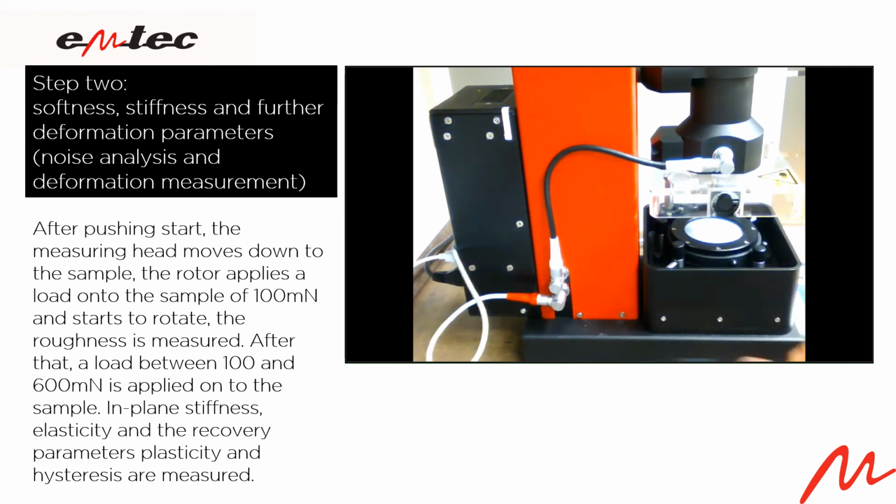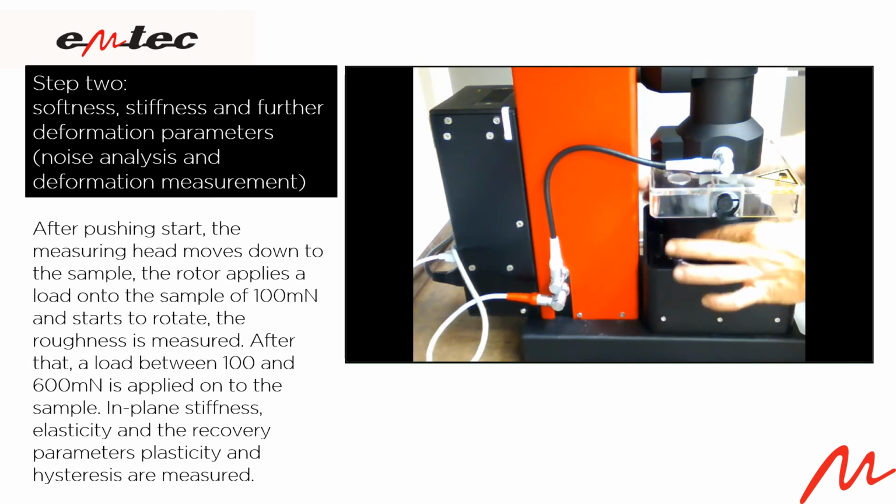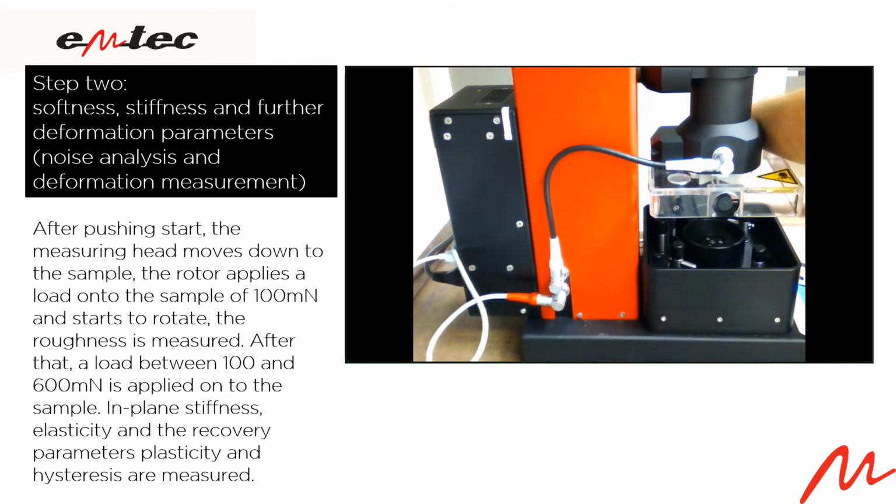This has to be done 5 times, maximum 8 times. The average value has to be taken, and then you can compare this to other materials. Important, always only average curves have to be compared.